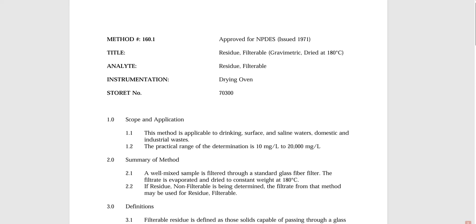Well, in that particular scenario, it was a way that we could bring in something that was not a liquid, and it was a solid for you. So you understand how these solids can actually work and be okay in a laboratory environment. But it was also a way that we could introduce an EPA formal method to you, so that way you could see kind of how the method originates. So where's the starting point? And then from that, a laboratory would take that method and modify it and change it and create their own SOPs that you would have to follow in-house.